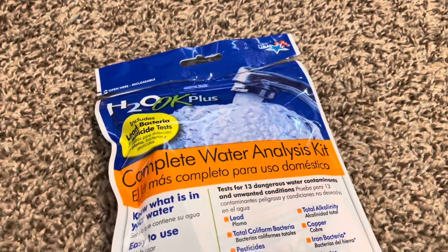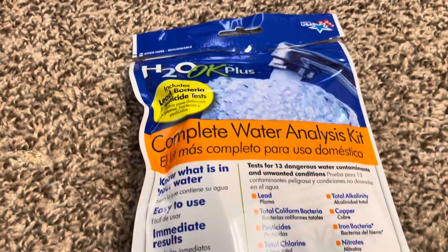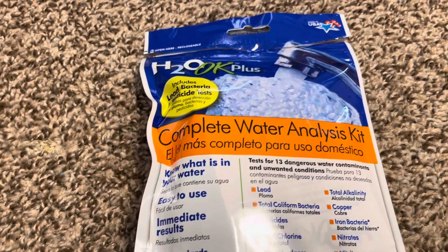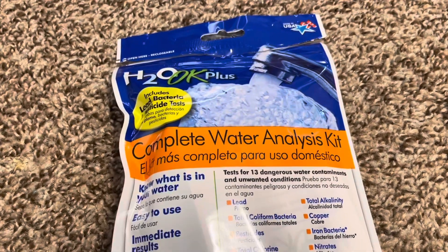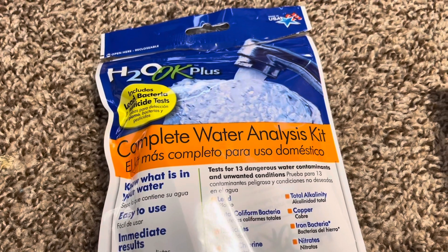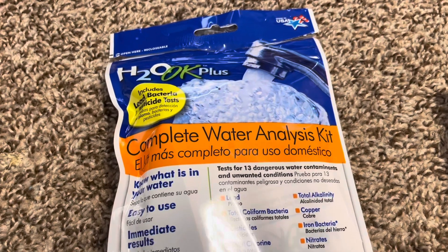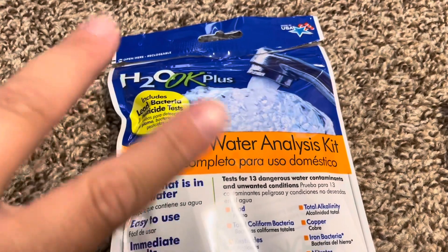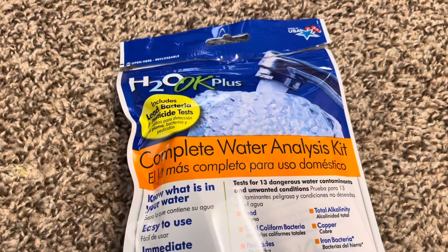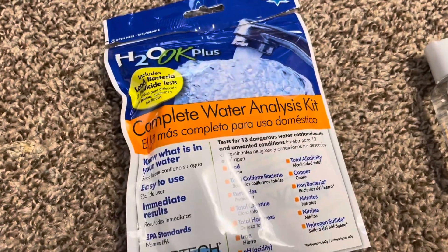I'm not having any issues with my water at all. I just thought — if you have public water, which I have, you get a report in the mail from the water company every so often. It tells you all the stuff that's in your water and says it's safe. But when you're reading the report and you see everything and what percentage is considered safe, all that stuff is still in the water. So I just wanted to get this and see what it says.